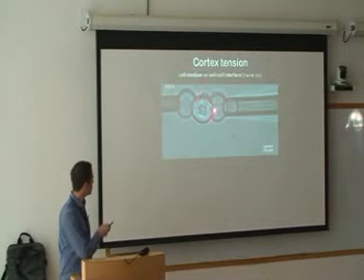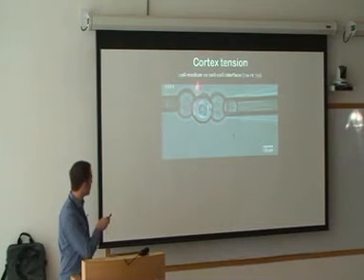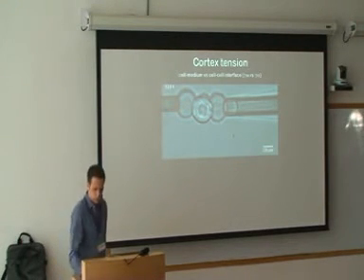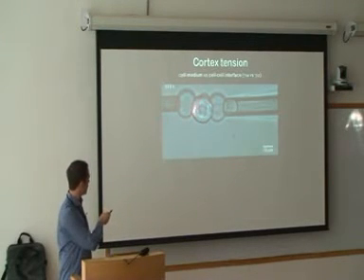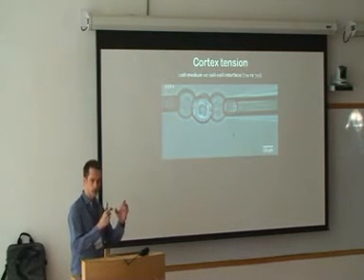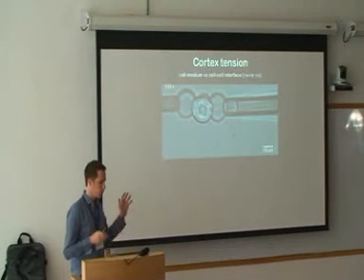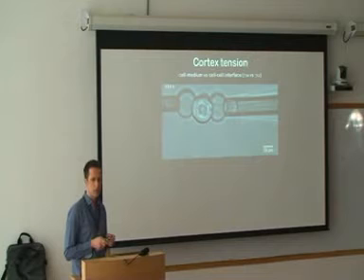So we want to look basically at the unperturbed cell, how it changes its shape upon separation of its cell-cell contact to another cell. And the idea is basically that you take this triplet. You're moving this cell away. It breaks perhaps here or here, and then you're looking how this cell, at its just exposed cell-cell interface, deforms. And the reason for that is that what we found before by just looking at myosin is that the cell-cell interface has less actomyosin. The cortex is reduced at the cell-cell interface.